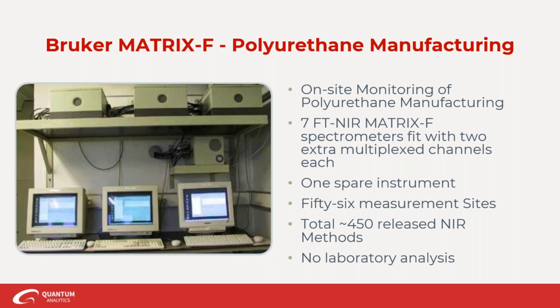So this place actually uses 7 Matrix F instruments, and then each of them is fit with 2 extra multiplex channels. So each one of those 7 instruments can measure up to 8 points in the process, and they have 1 spare instrument. So in total, there's 56 measurement sites, and they are using approximately 450 different near-infrared methods and models to monitor the stuff there. So they don't have to do any laboratory analysis. I imagine they do some, to check the models and validation from time to time, but they're not required to do any laboratory analysis. And I imagine they keep pretty busy there. If I worked in this place, I would probably never, ever get a day off.